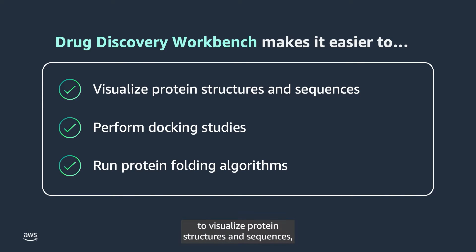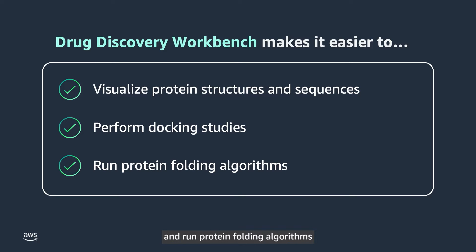visualize protein structures and sequences, perform docking studies, and run protein folding algorithms in a single easy-to-use interface.